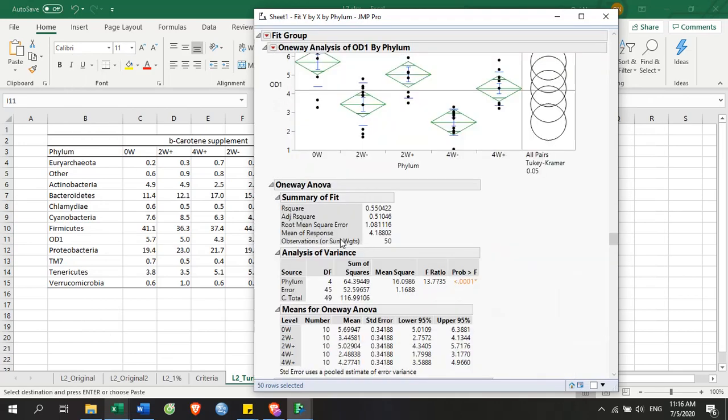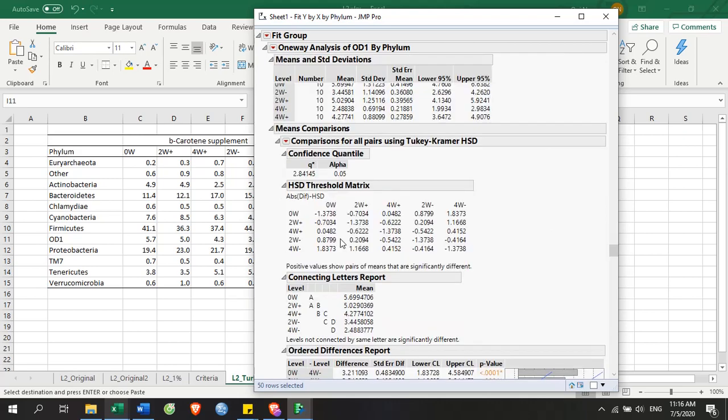And OD1. Is it that they have never found a name for it? This is the name of it. You want to tell me the whole world does not have any name to give to this? I don't know why it's named like this. Yeah, I also don't know. And the TM7? Maybe it's like an abbreviation of some author's name, like Peter one.